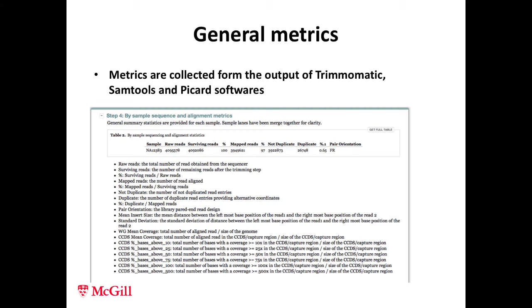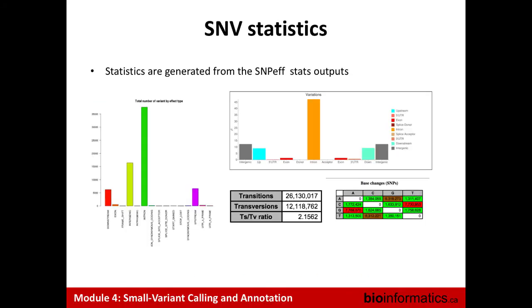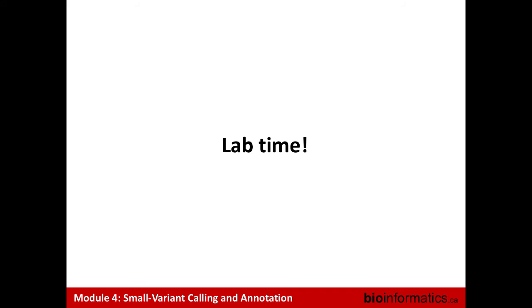One of my general messages: metrics. I need to update that next time to put some MultiQC instead of this old-fashioned report. And just to let you know, what is cool about SnpEff is that it also provides a lot of statistics on the variants, and we'll see that during the practical later today. Okay? Any questions?